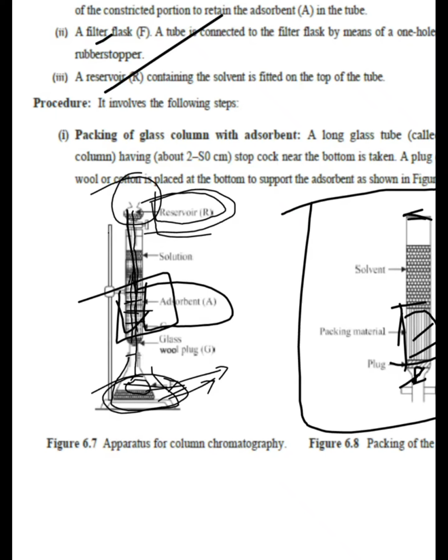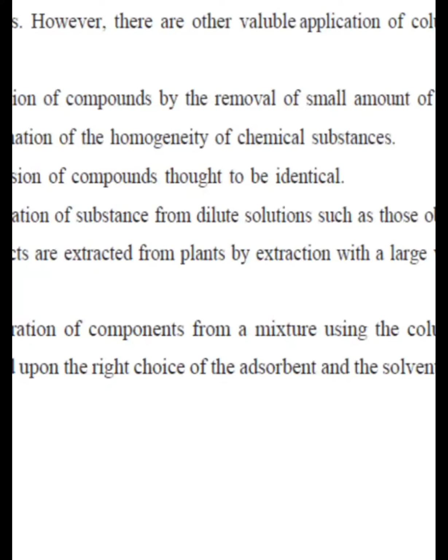And further, the development of chromatogram is nothing but you are going to get different bands. Those different bands are known as the development of the chromatogram. This is the experimental technique used for the separation of the given samples.